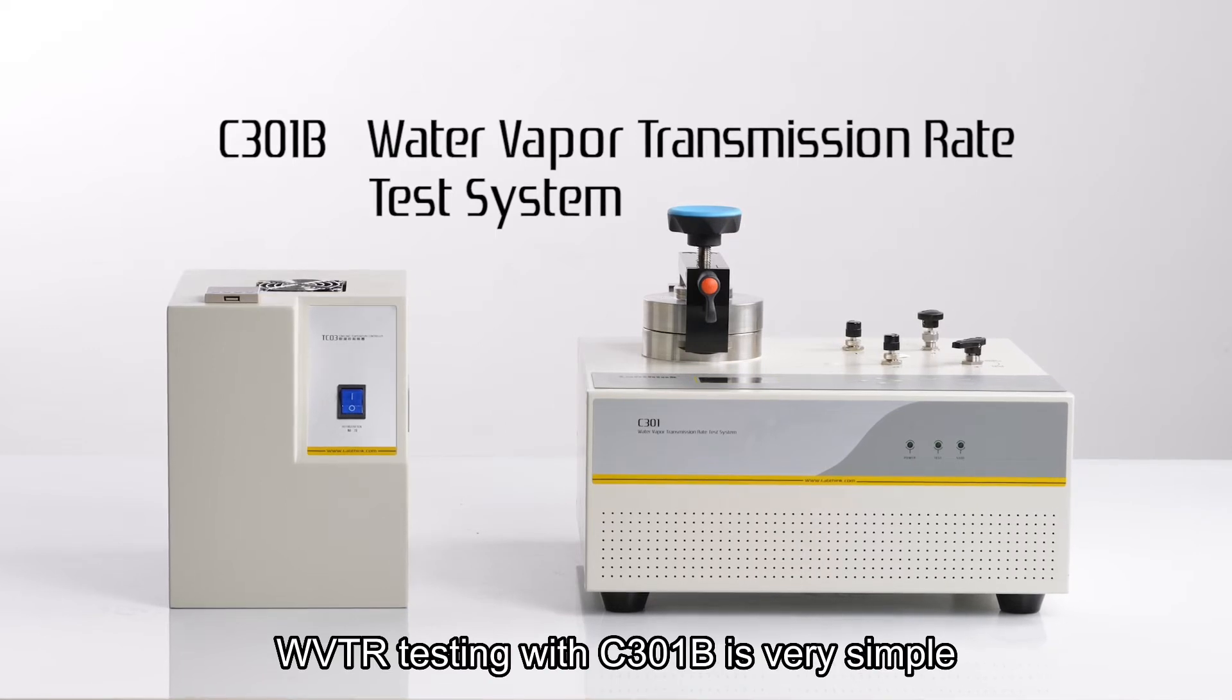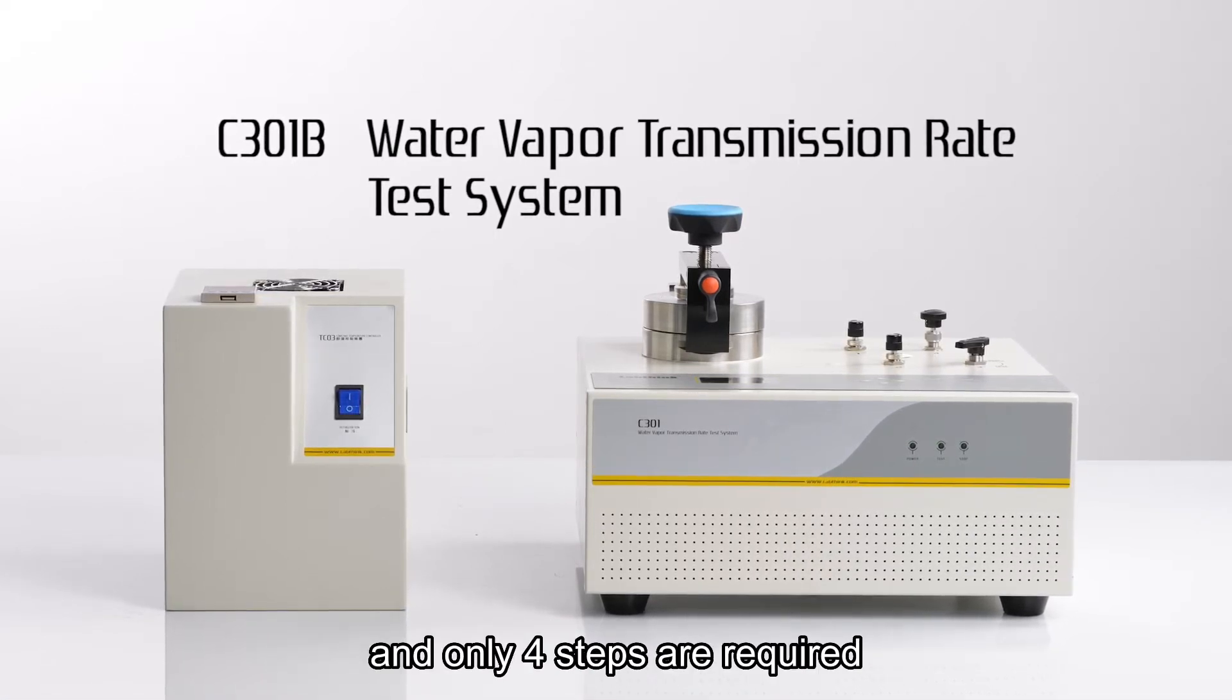WVTR testing with C301B is very simple and only four steps are required.